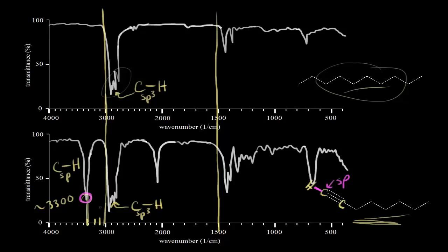And so once again, it's useful for analyzing here. We have something else that shows up in the diagnostic region for this alkyne, and it's this signal right here. If we drop down, what's the wave number where this signal appears? The wave number is about 2,100, so approximately 2,100, maybe a little bit higher than that. And that's the carbon triple bond stretch that we talked about in an earlier video. So that's approximately the triple bond region when you're looking at your spectrum.